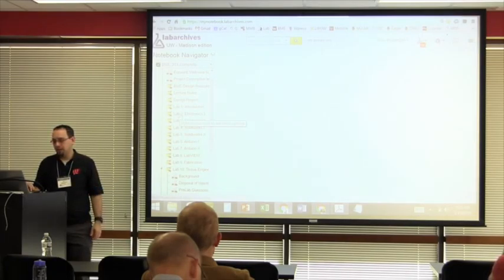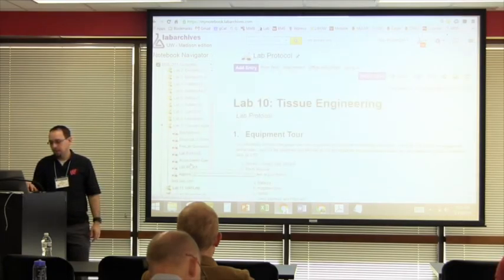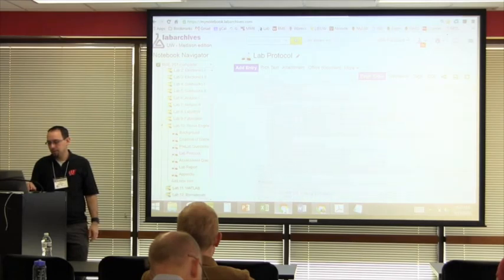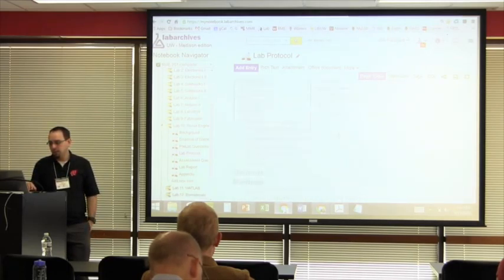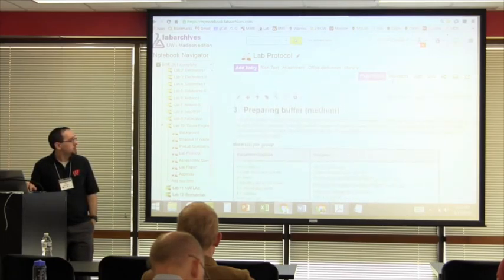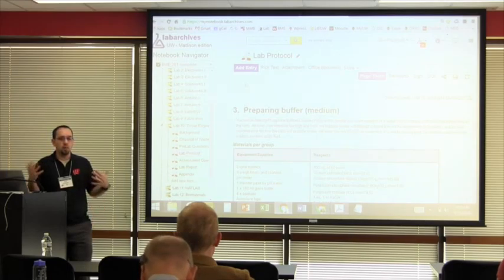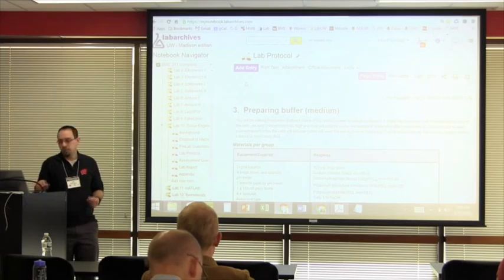So this is an example of our complete notebook. This is the tissue engineering lab that I showed you. The students can easily see — we actually have, you can see right here, this is a dotted line right across here. So we have multiple text entries even on one page, sort of different parts of the lab.